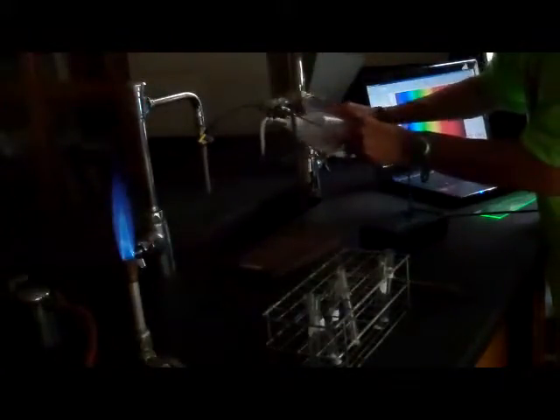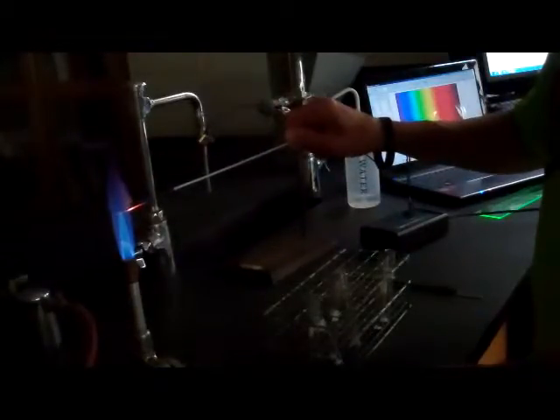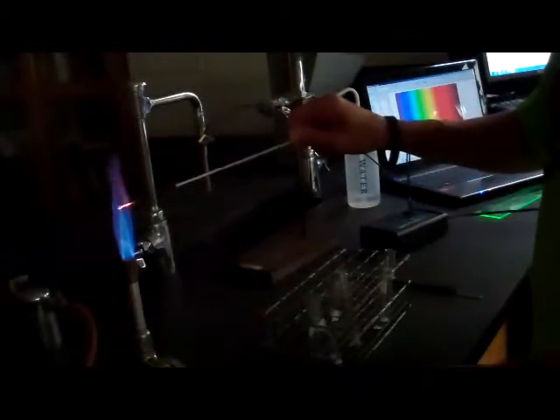You can still see we're rinsing the loop. It has quite a bit on it yet, so make sure it's completely cleaned off. Still getting some contaminating colors. Still see some solid on there.